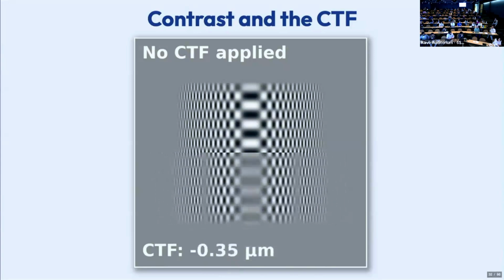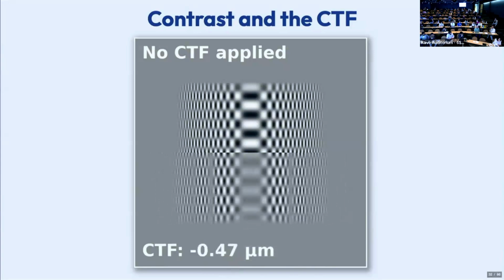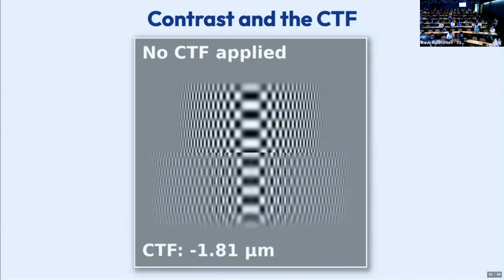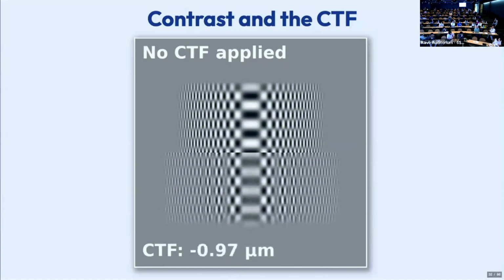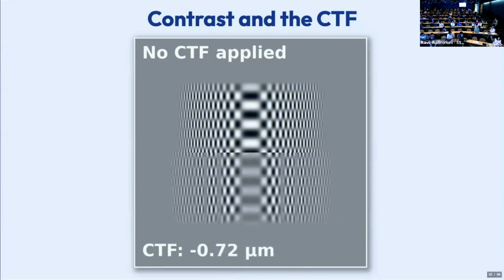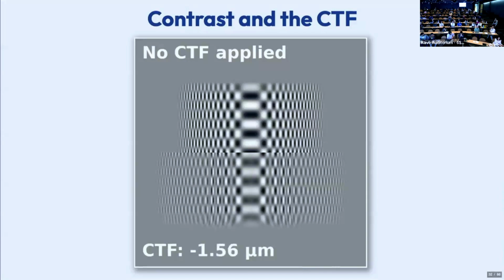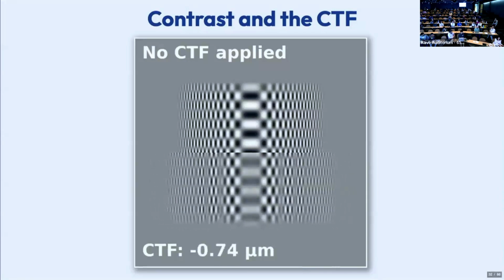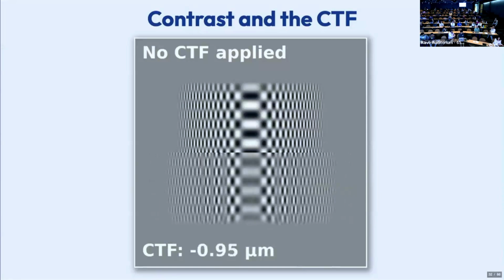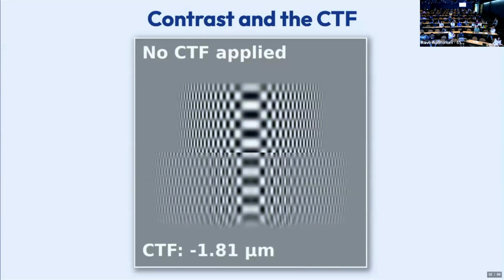And then you can use all the frames, which even though the later frames have more damage, you still have better statistics. So that means the image is highest signal to noise at low frequency, because the low frequency information is very useful for determining the particle orientations.